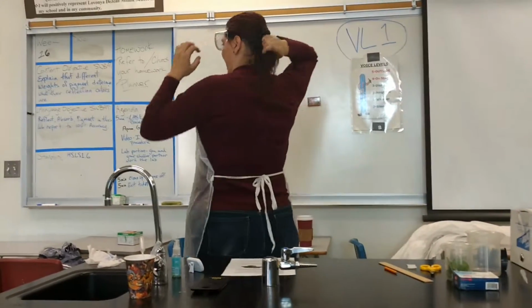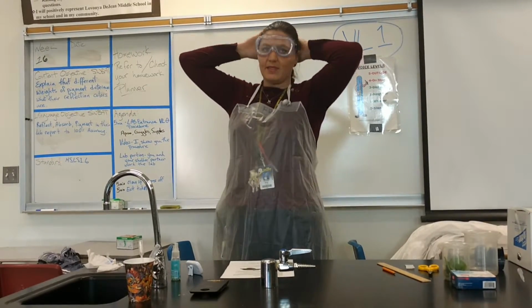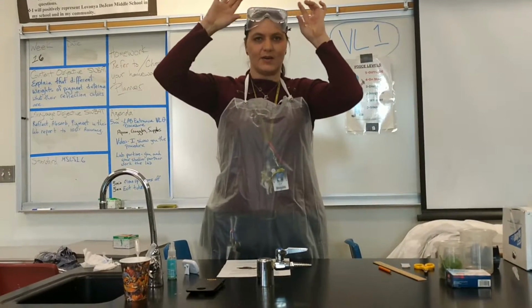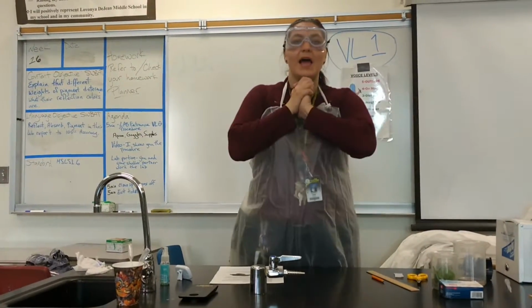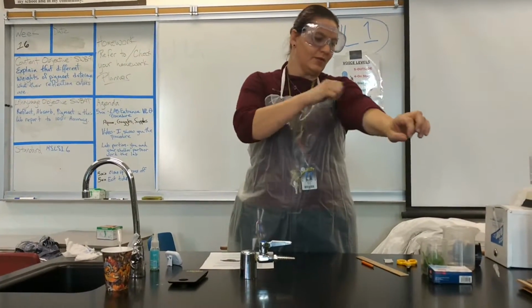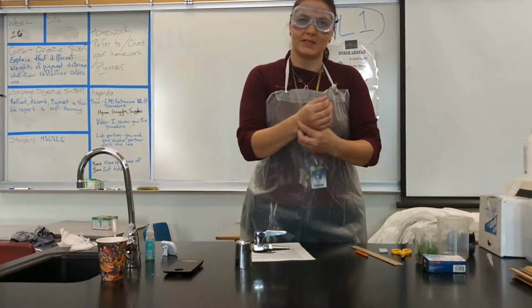My hair is pulled back, and now it's also clamped between my ponytail and the strap. It's on tight, so it's not going to go up here or down here. Tighten it up a little bit more just to make sure it's safe. All right, so now we're going to go ahead and go to the checklist. My arms are nice, although I will move the sleeves up a little bit because I don't feel as able to move around with my sleeves down.